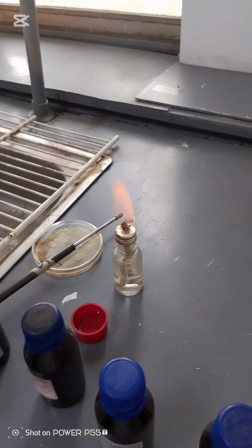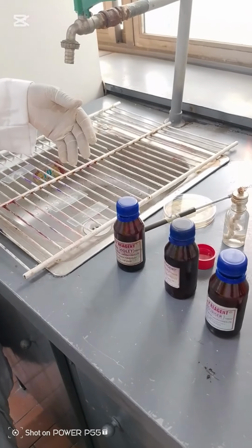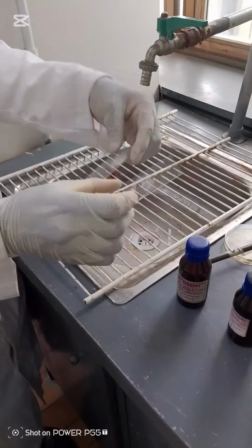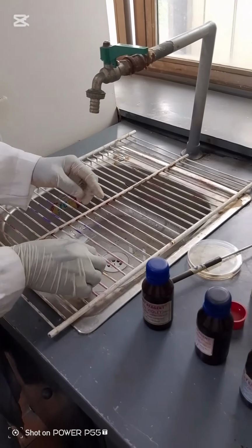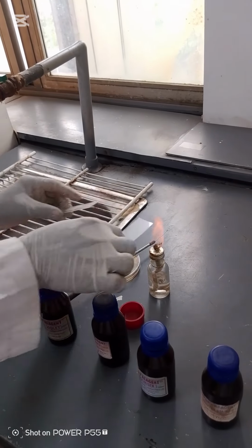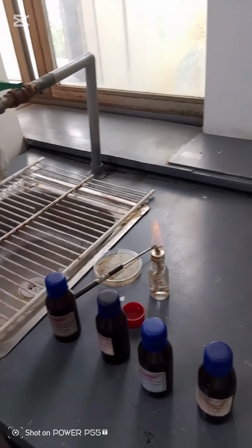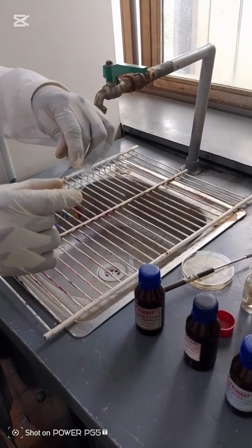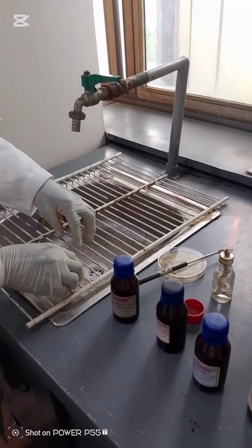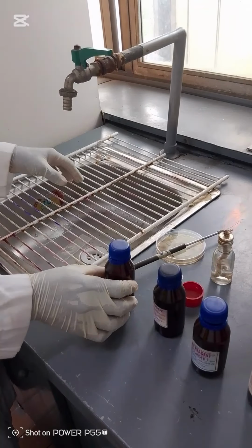Now, you allow your smear to air dry before you start staining. The bacterial cell smear that we made has air dried, so you fix it by passing it through the flame. You fix the bacterial cell to kill the bacteria, and to allow the bacterial cell to stick to the slide, so that when you are staining, it will not be washed off.